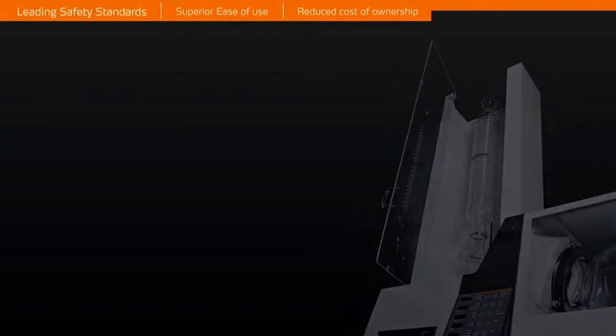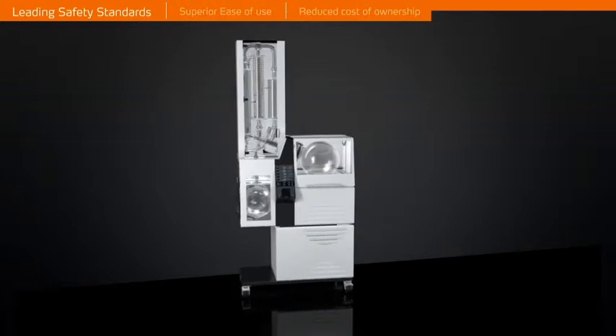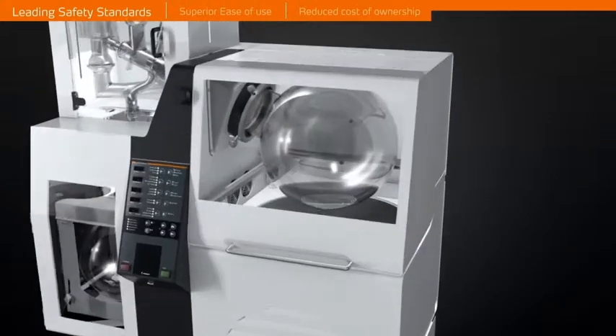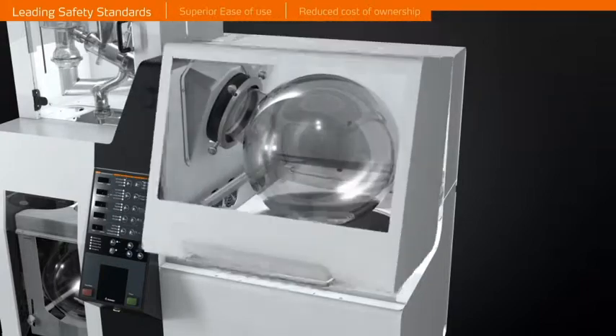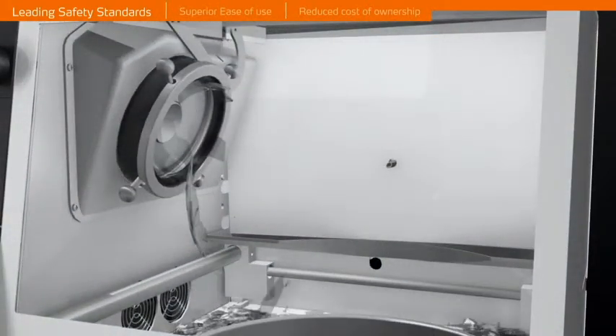A guard hood consisting of a metal frame and European ESG rated safety glass covers the bath completely. This prevents any operator contact with steam, splashing bath fluid, and even shards of glass in case of accidental flask breakage.